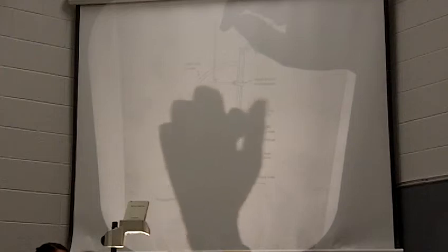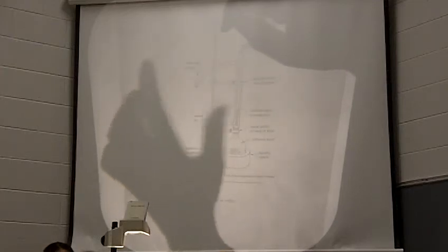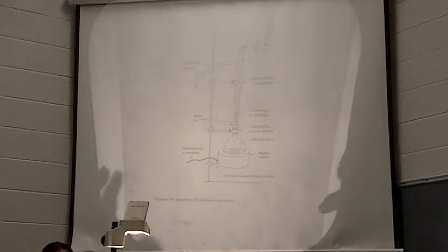So again, we're fighting gravity to push it up through the condenser and then out the top. So just like your simple distillation, you want to set this up next to your sink. Don't have it way over to one side and the sink way over here, because we've got to get the water back into the sink again, all right?